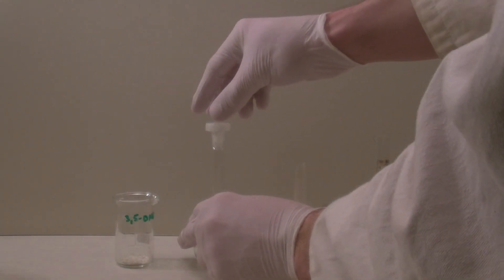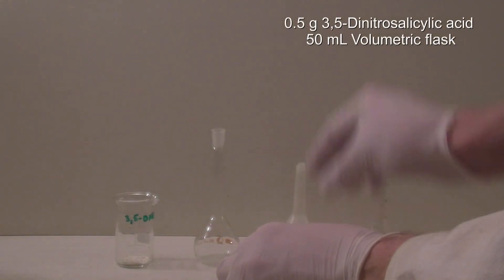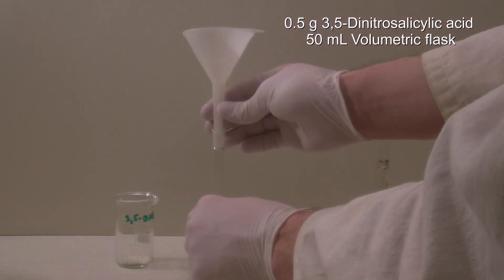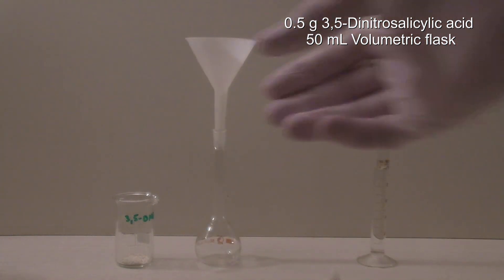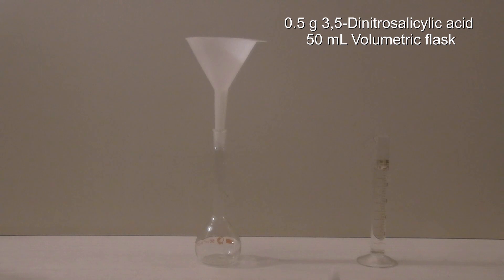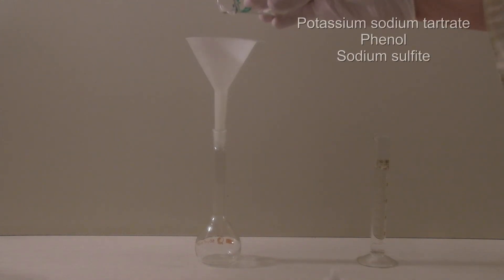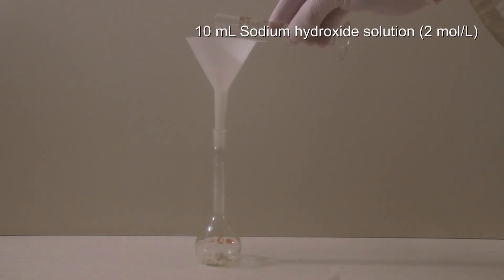To prepare the DNS reagent, 0.5 grams of 3,5-dinitrosalicylic acid are added to a 50 milliliter volumetric flask. In the lab more substances like potassium sodium tartrate, phenol and sodium sulfite are added to increase the stability and sensitivity of the reagent. To this, 10 milliliters of a 2-molar sodium hydroxide solution are added. The yellow sodium salt of the dinitrosalicylic acid is formed immediately.